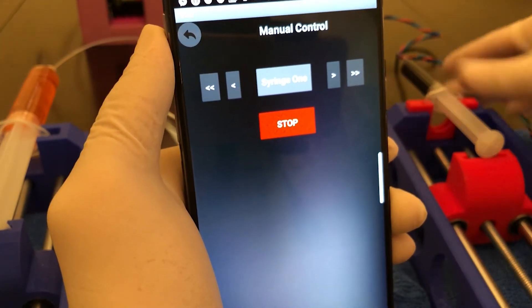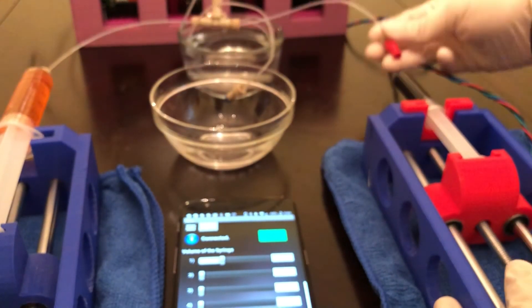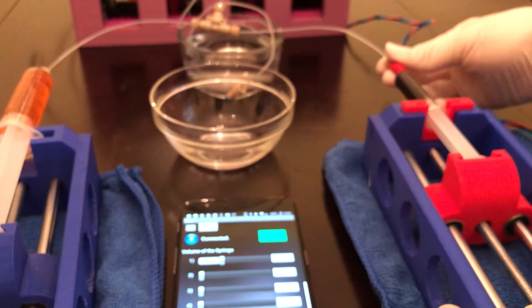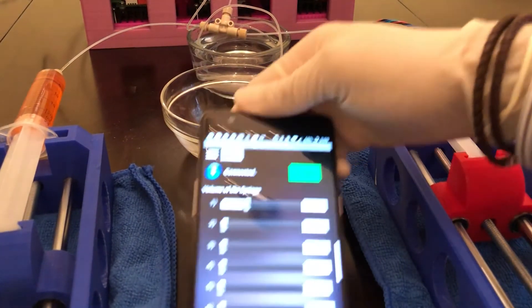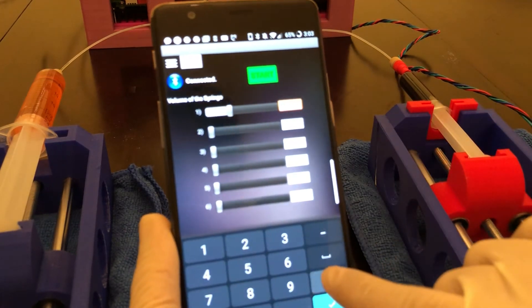Using the app, adjust the distance for the plunger so it fits perfectly. You can move the pushing block forward or backward, quickly or slowly, depending on how far off it is. Insert the volume flow rate and the internal diameter and click start.